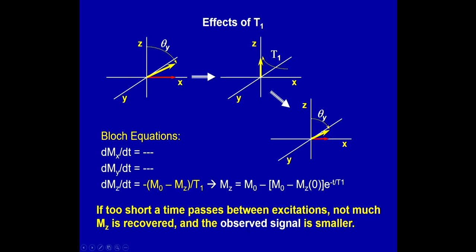Now, keep in mind, if you were to plug in, say, 0, which corresponds to a 90-degree pulse, and you may want to try this in Excel, plug in this equation and track a whole series of values of small t versus T1, track how long it takes to recover full Mz magnetization, the full M0.